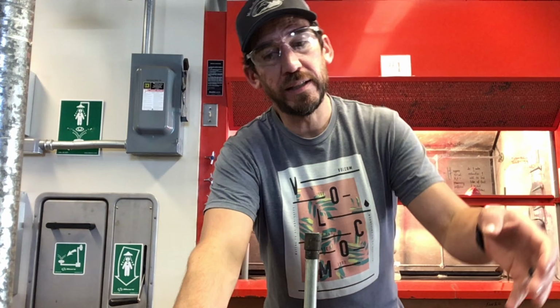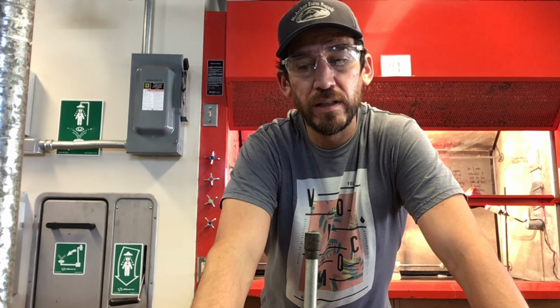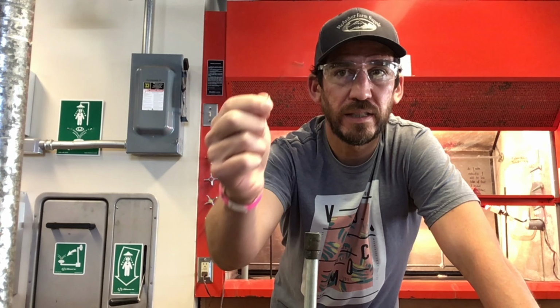So what the green is, since this is a copper wire, we're actually creating little copper halide compounds that are beautiful and volatile, and so that's why we get to see them go boom, like magic, okay? First things first, you want to go ahead and burn this. I've already burned it to create a copper oxide layer on the outside, and then go ahead and start.